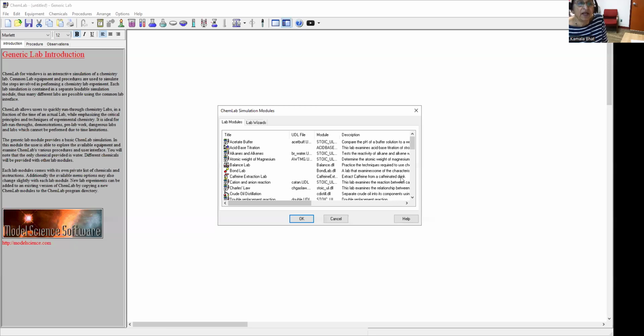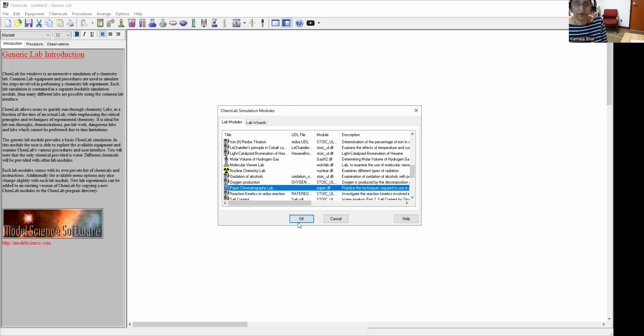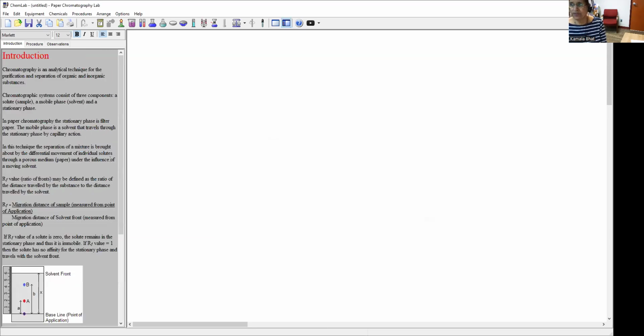And so with that, I'm going to share my screen with you, and we'll perform it together. So we go and share. We go to the file again, open up a new file, and we call it partition 1, 2, 3. Paper chromatography lab. This technology is very much used when we are doing research.